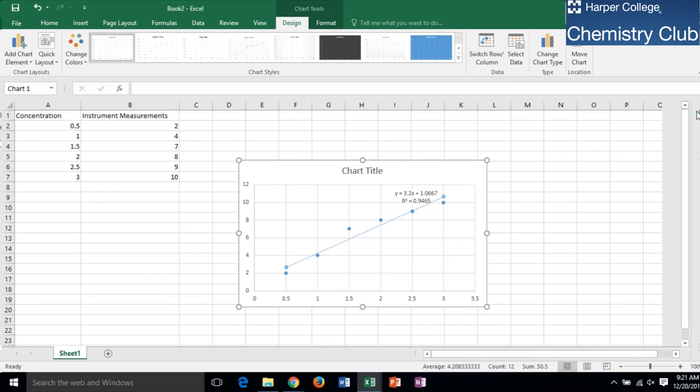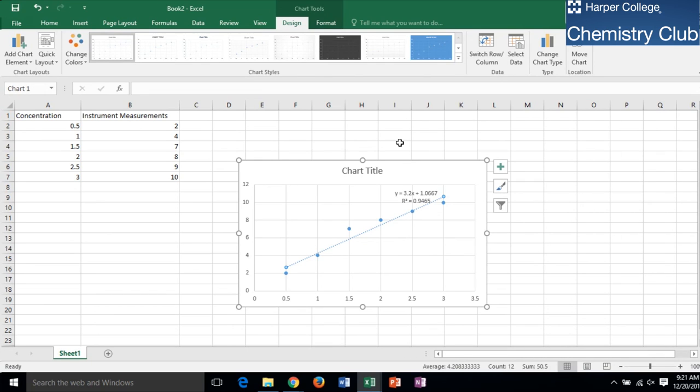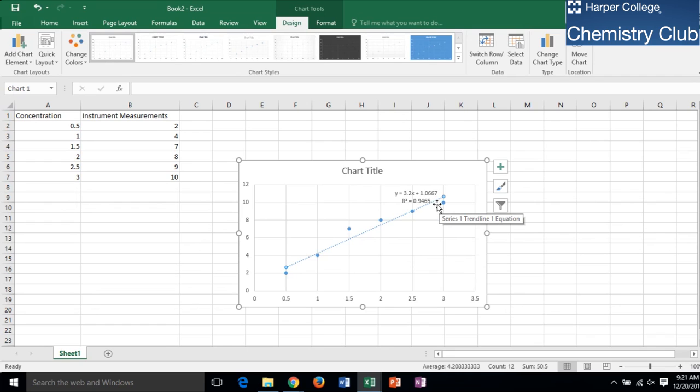The R-Squared Value indicates the reliability of the curve generated by the computer. Because the curve we made has an R-Squared Value of 0.947, which is close to 1, we know that the curve is very reliable.